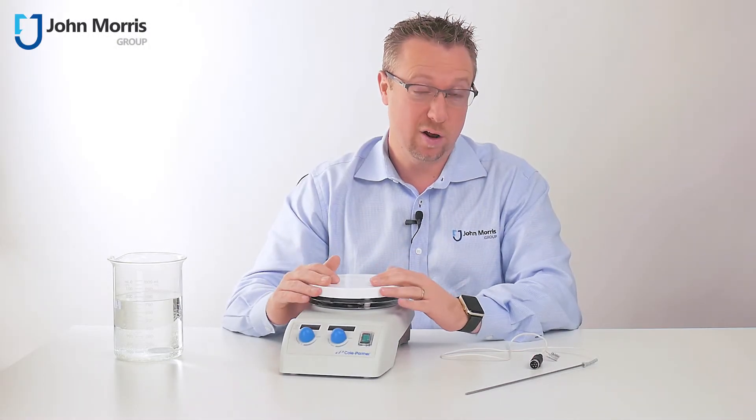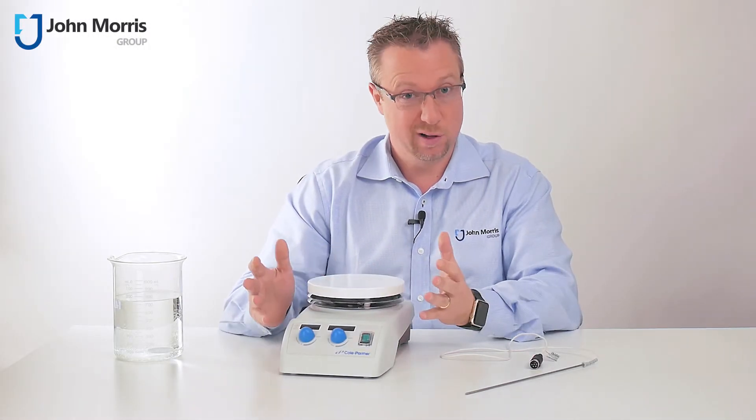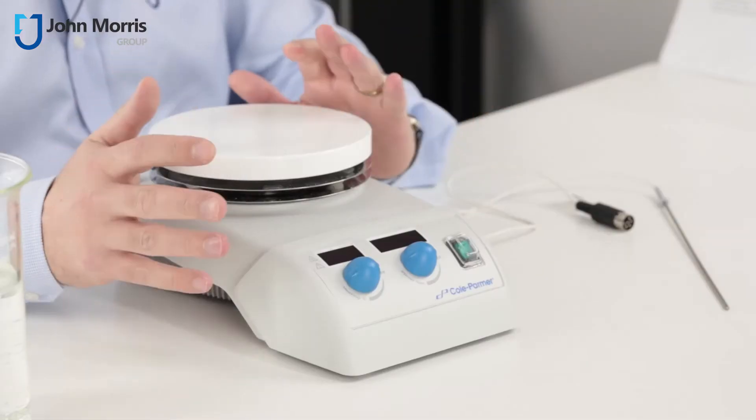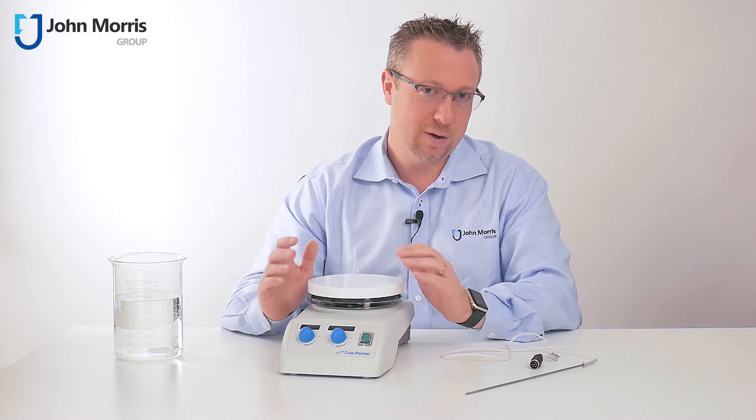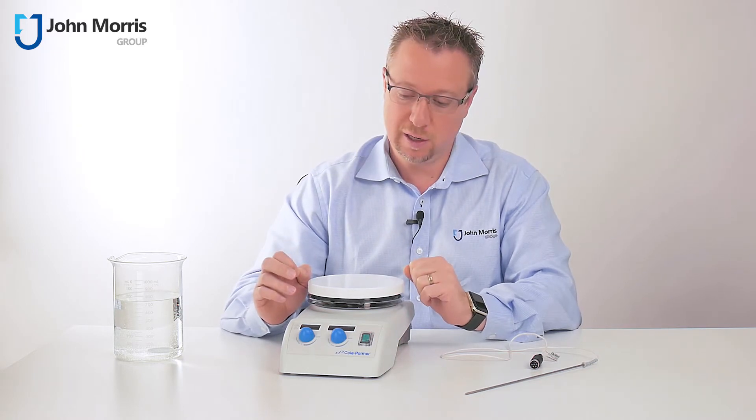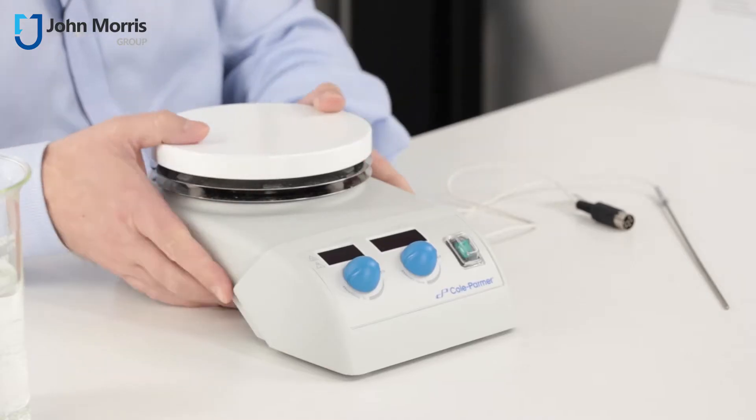Firstly, why I love this particular hotplate magnetic stirrer. Well, it does what it says it does — it heats and it stirs, and it's only $800. But there are a couple of cool features about this particular unit that I'd like to draw your attention to.